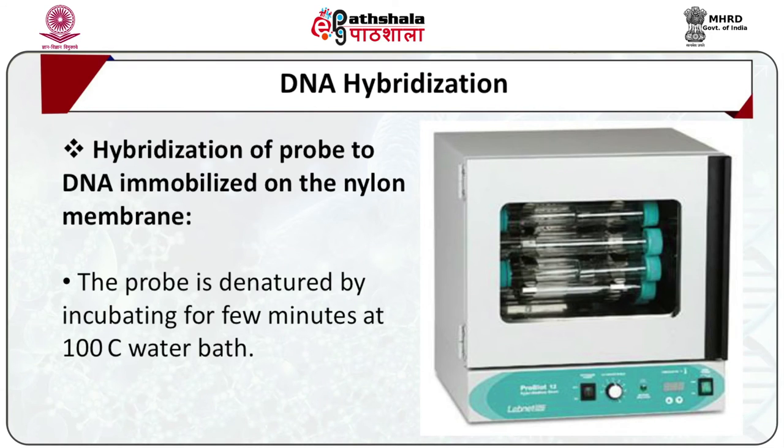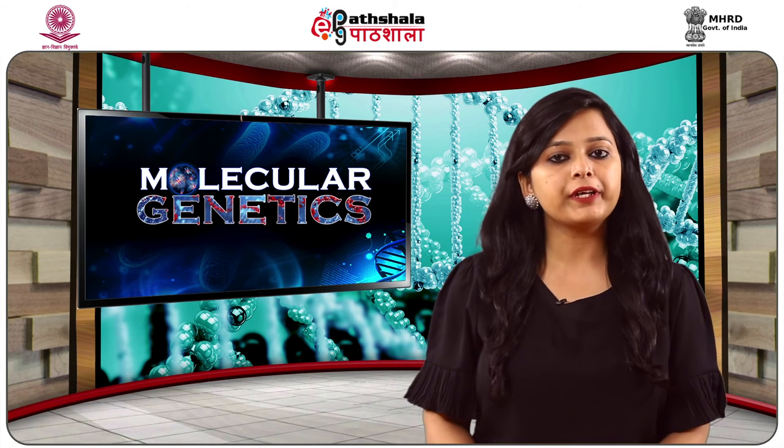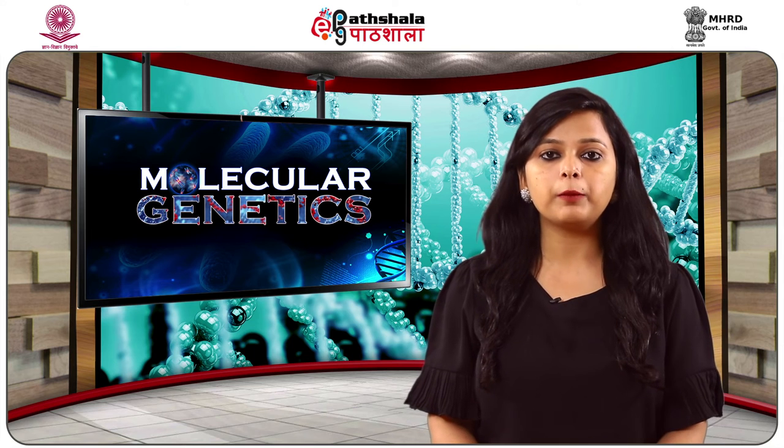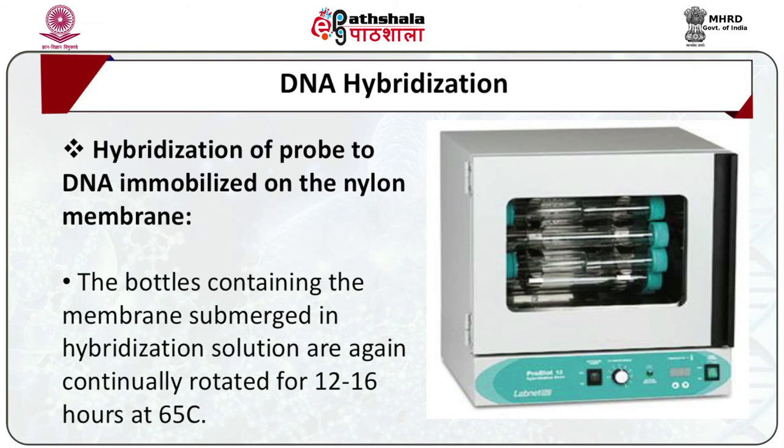The second step is hybridization. The probe is denatured by incubating for a few minutes at 100 degrees centigrade in a water bath. The denatured probe is then added into the bottle containing the membrane, which is submerged in pre-hybridization solution. This pre-hybridization solution, now containing the probe, is called the hybridization solution. The bottles containing the membrane submerged in hybridization solution are again continually rotated for 12 to 16 hours at 65 degrees centigrade.